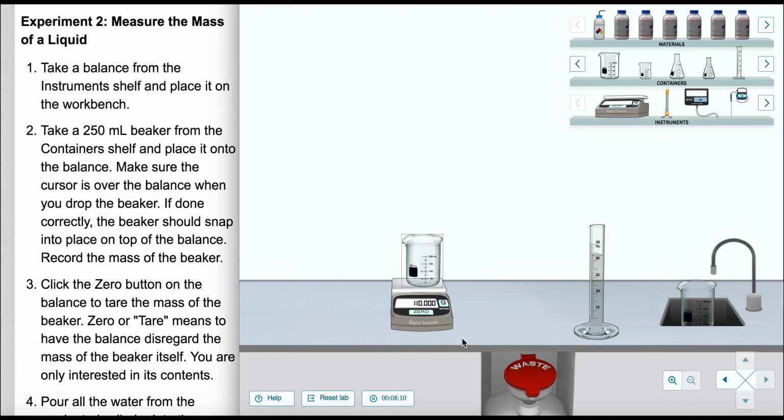If you remember when we did the graduated cylinder earlier, we talked about how it was important that if something was directly on the line, make it 43.0 milliliters. It's the same thing here. It's almost like this is on a line here, and you need to write 110.000 grams, because that is the precision of that specific measurement. If it was 0.001, you'd have no problem writing 0.001. If it's 0.000, you should do the same thing. The unit here is grams, because that's what it says on the balance. That's what you should write down as well.